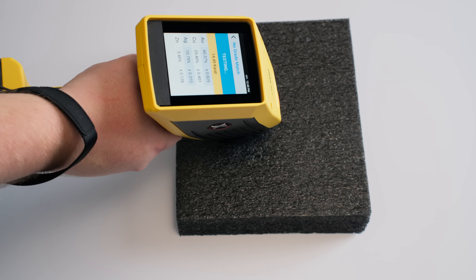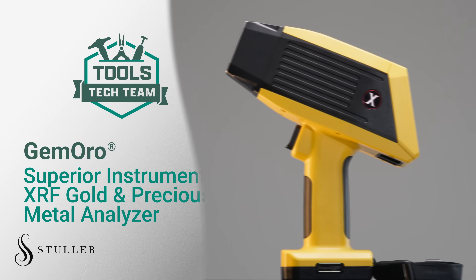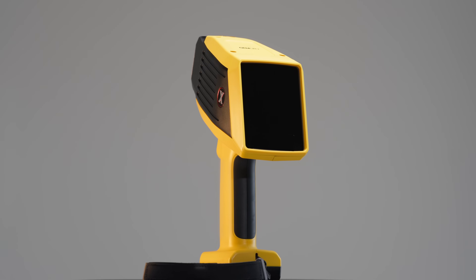Hey everyone, today we're taking a deep dive into one of the most powerful tools for precious metal buyers — the GemOro XRF analyzer. You'll get results in seconds.